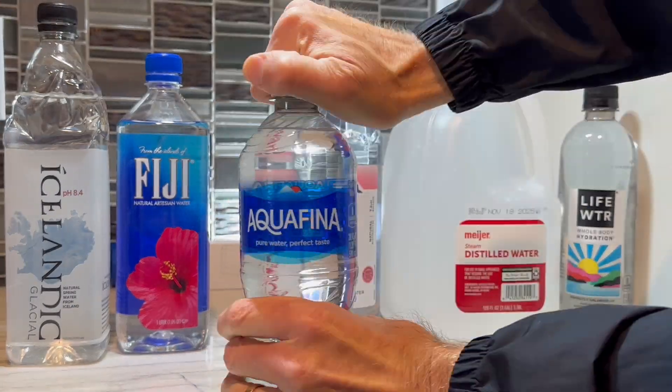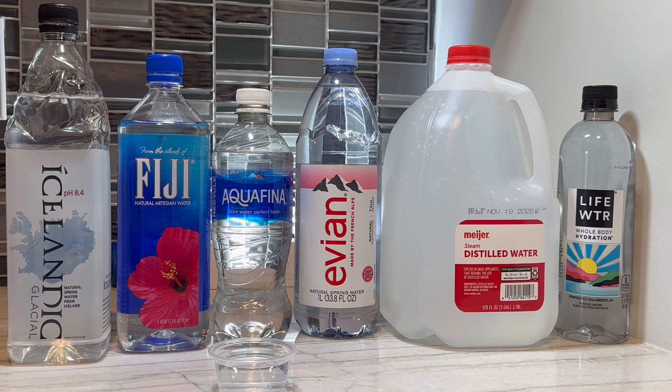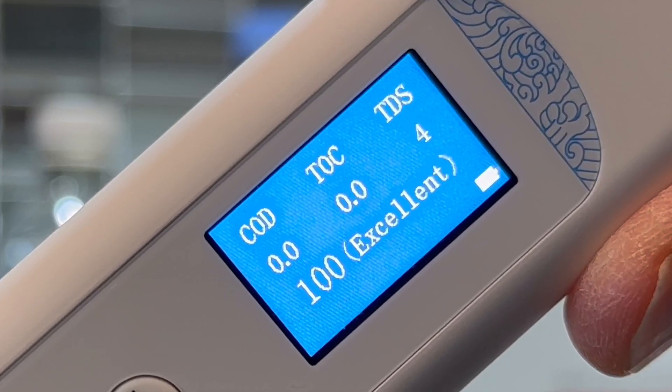Now we're going to test Aquafina, which is purified by reverse osmosis. I'll sometimes use Aquafina in my experiments if I can't find a source of distilled water. Sure enough, TDS for Aquafina only measures 4 parts per million, and the other two are zero.